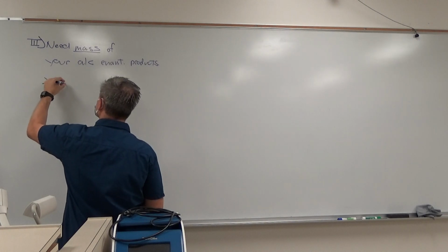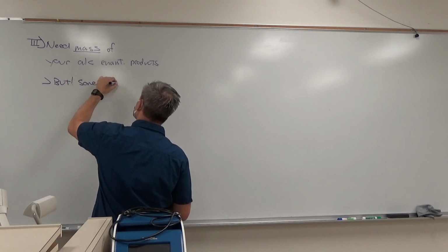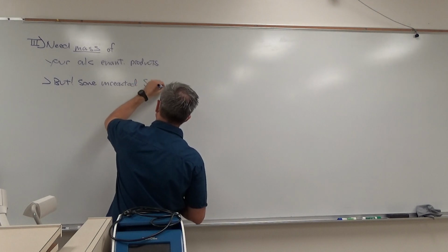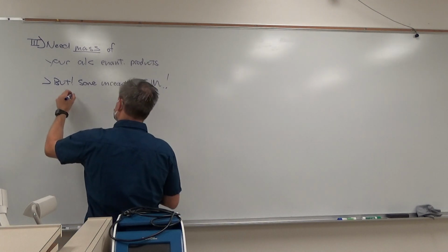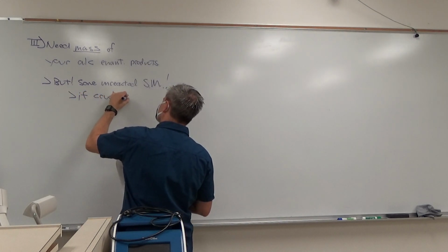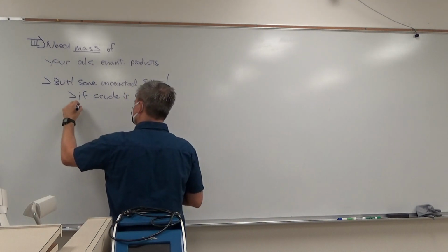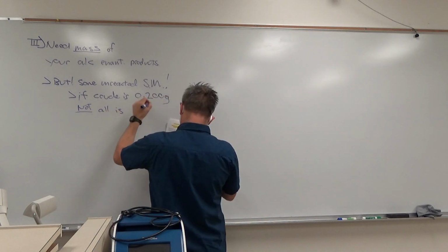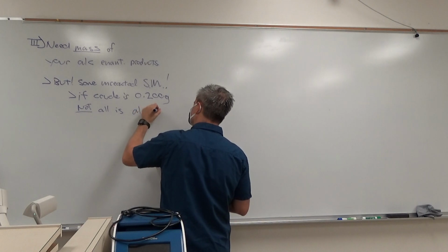But there is some unreacted starting material. Okay? If your crude is 0.200 grams, not all is alcohol mixture.